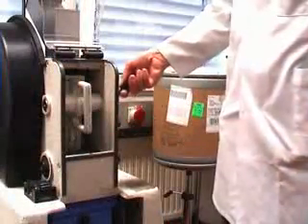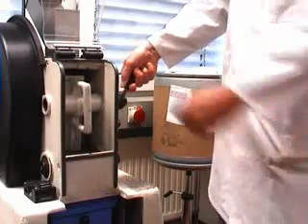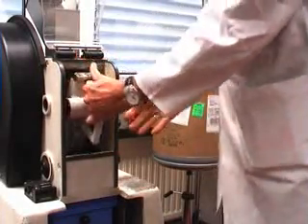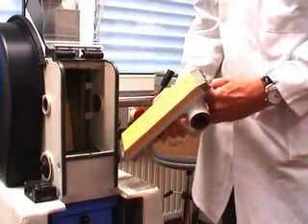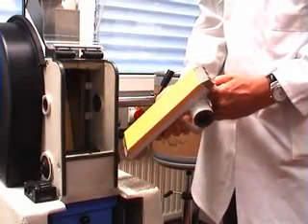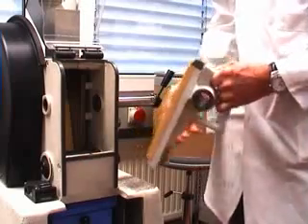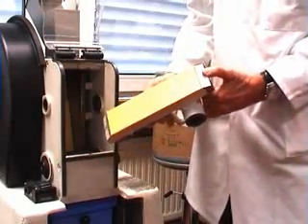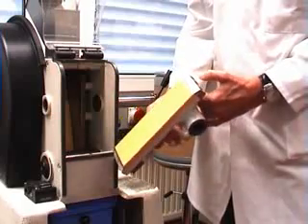After milling it is important to clean the machine to avoid any cross contamination. This can be done with the Pulver Z1 very easily by just removing the jaw and then using a vacuum cleaner with a brush to clean the milling chamber inside.